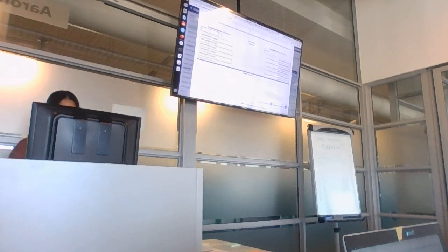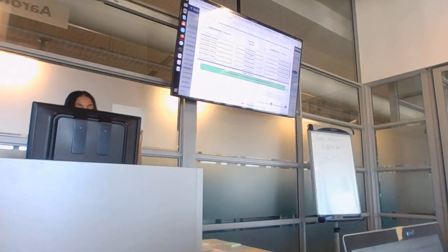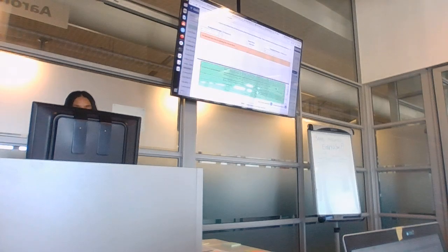If you put in R1, nothing will happen because there isn't an R1, but there is an _1 and an _2, like we said, that separates the reads. So if you put in the correct pattern, it will automatically put the two pairs next to each other. Then it's up to you to either click on these individually to pair them or auto pair, and they will pair all of them at the bottom.